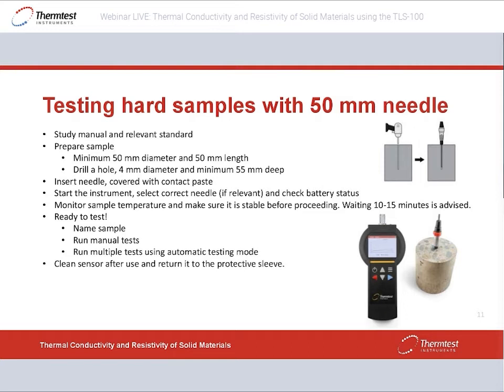We need to make sure that this temperature is stable, as we have already discussed. Sometimes you have to wait a little bit. I would suggest maybe waiting 10-15 minutes, especially if the hole is a tight fit for the needle. You can actually generate some heat from friction when pushing the needle in. So make sure that the temperature is allowed to even out. Now you're ready to test.